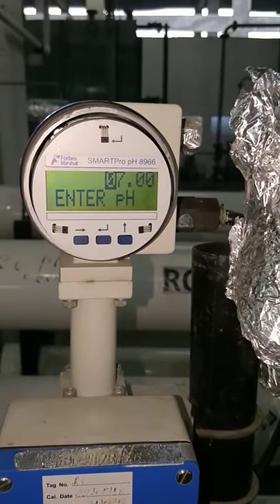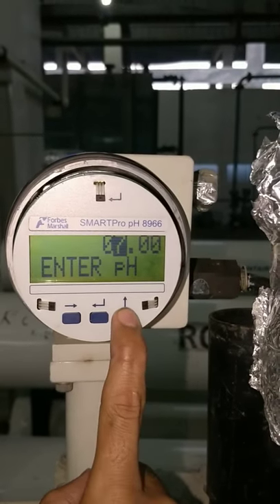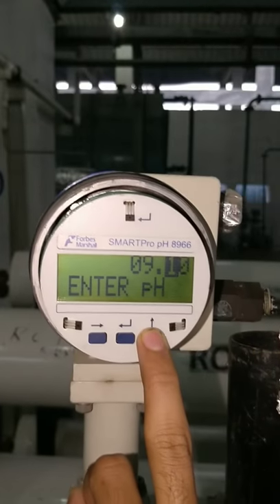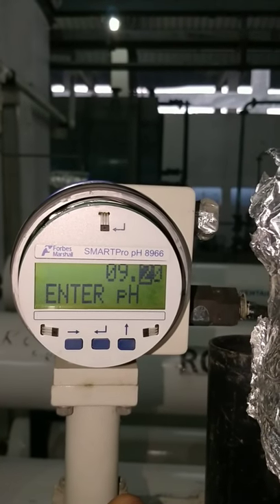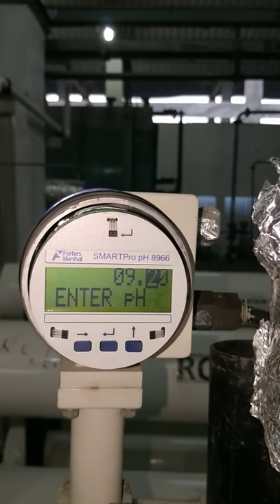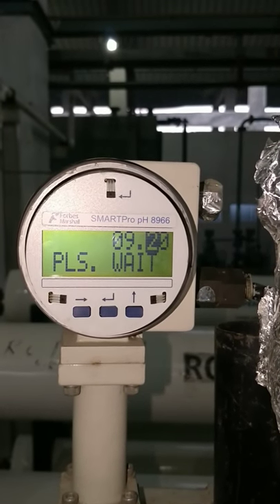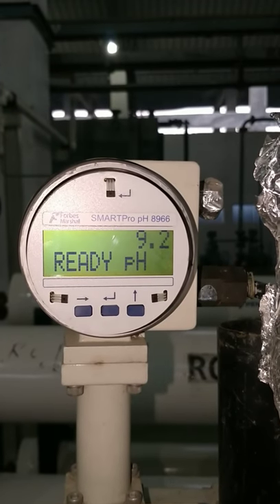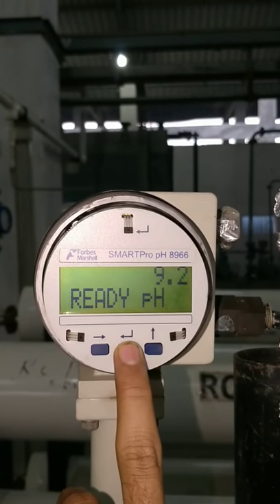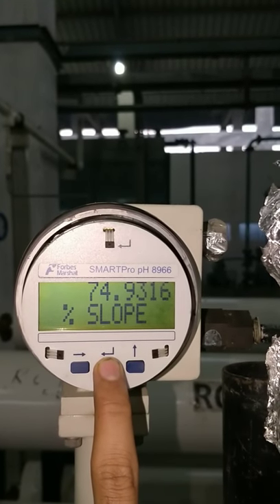After 5 or 10 seconds, we will enter the PH value. It has read the PH as 9.2. Now, we will press enter. This is the slope value — if there is any error, it will show the error.